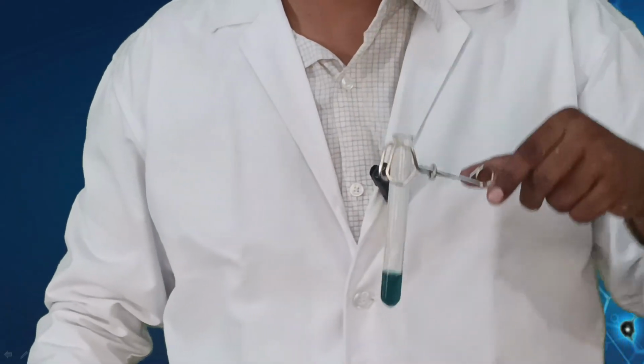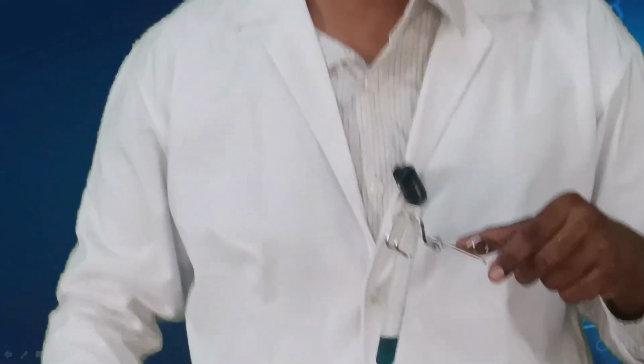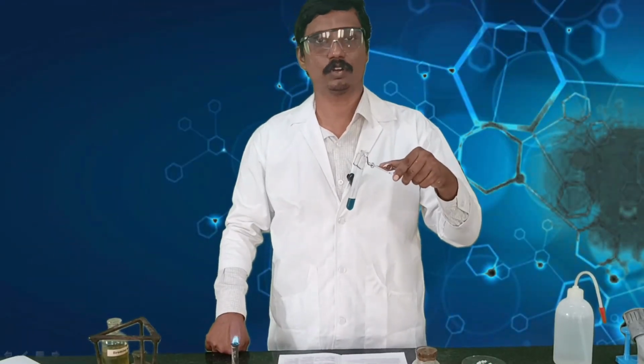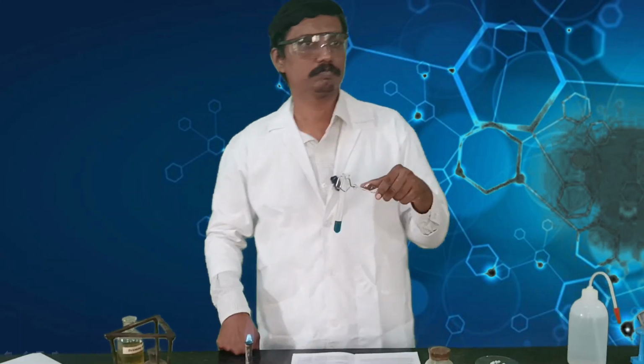So this is a very important test to decide whether the functional group that you would estimate contains nitrogen or not. If your solution turns bluish green, it means that it can be an amide, it can be aniline, it can be say a nitro compound, and so on.